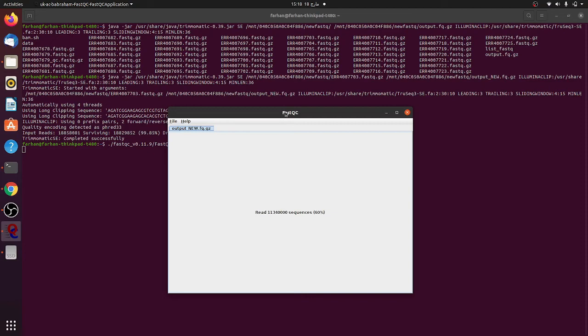If again the results are not coming good, it means the FASTQ file is very poor and it will be difficult to improve the quality of the file. Now it's almost 75% done. Let's see what we have here.